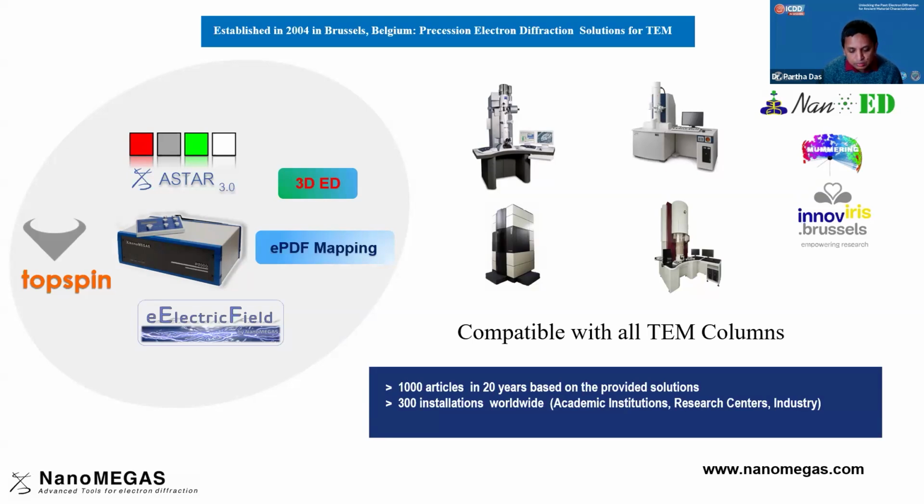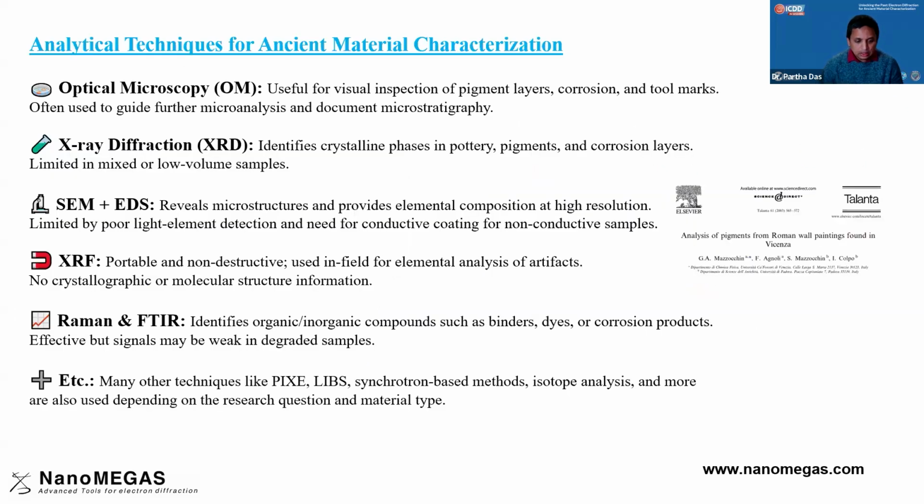Now I'll walk through a few examples during our presentation, especially those related to the analysis of ancient materials. Here is a quick overview of the techniques which are mostly used for ancient material study.